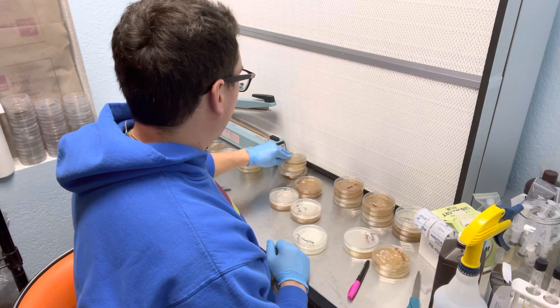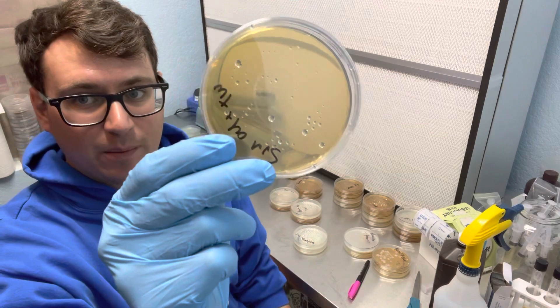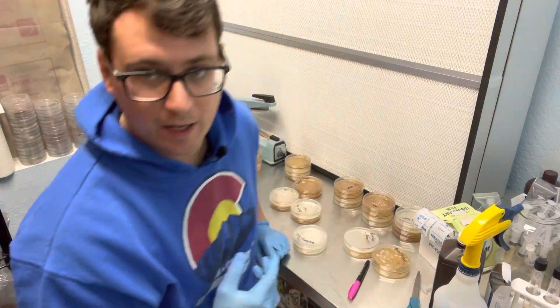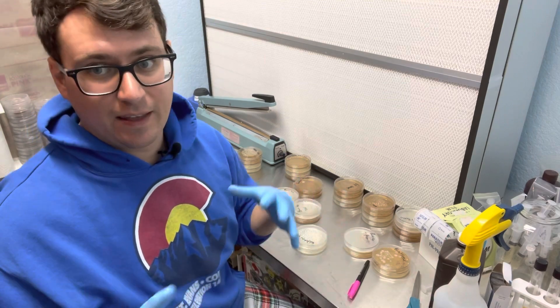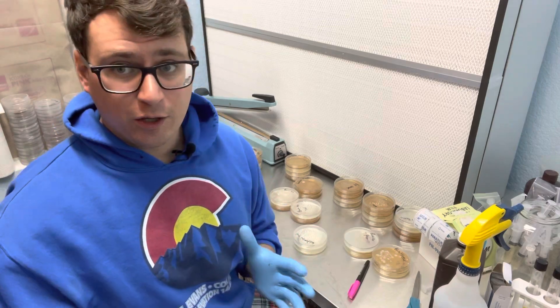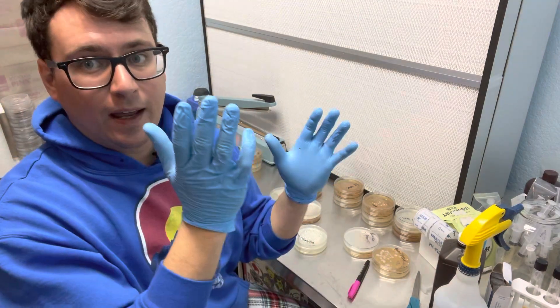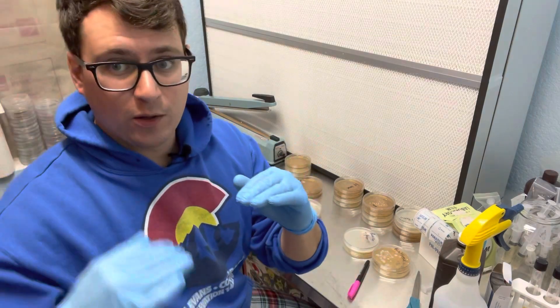So then we've got our local Colorado oyster from the summer — still haven't seen any germination. It's not too concerning, but I'm going to come back in about 12 or 15 hours and hopefully we get some germination on those plates. Then next Monday I am going to do my sectoring. I poured about 100 petri dishes and I'm going to take different phenotypes, put them on those petri dishes to grow out, and then I'll do my breeding test runs on bulk substrate from all those different phenotypes.